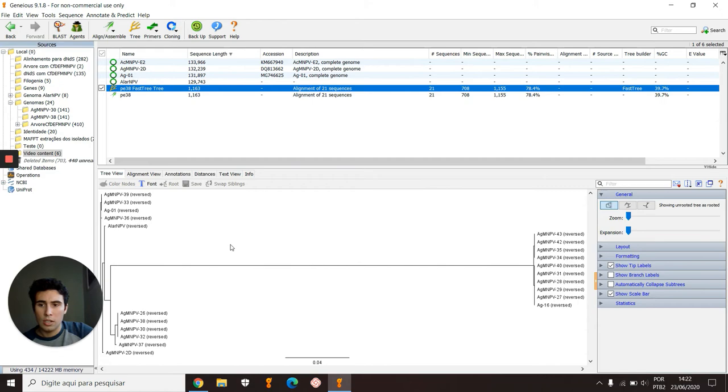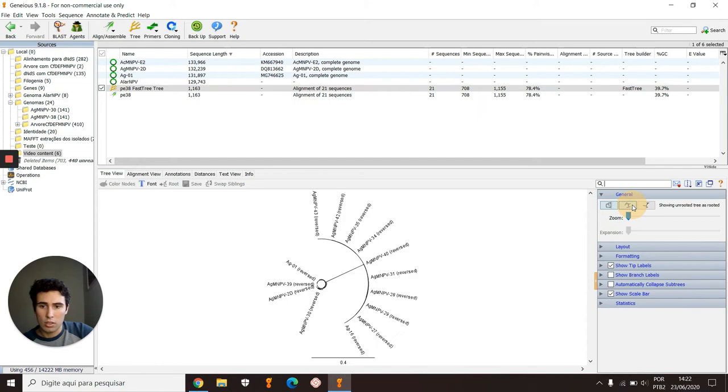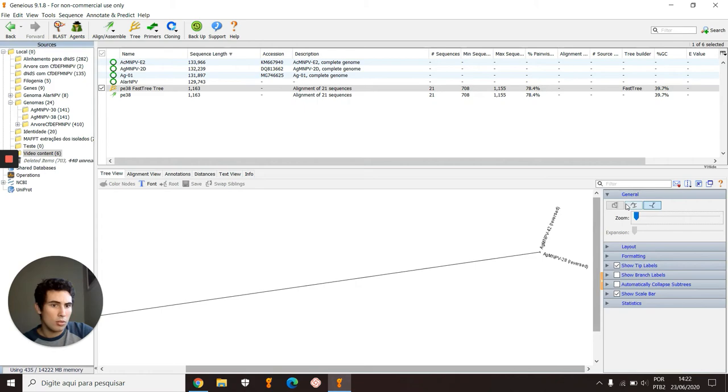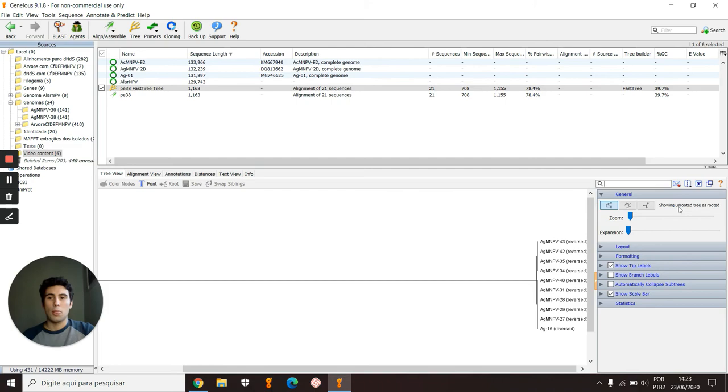And it is required that you align these documents to do the FastTree. It is pretty simple. You just click right here FastTree and give an OK. And here it is. We have this option of viewing, or this one, or this one. You can zoom in, zoom out. You can also do this phylogeny to whole genomes or just the common genes of this genome. You can use your imagination to prepare the documents with the tools you learned here. And basically, that's it.